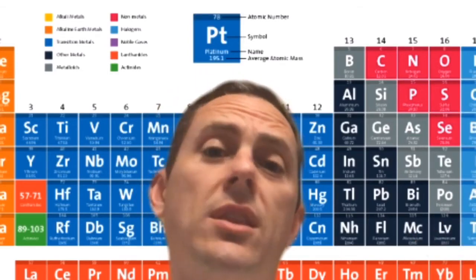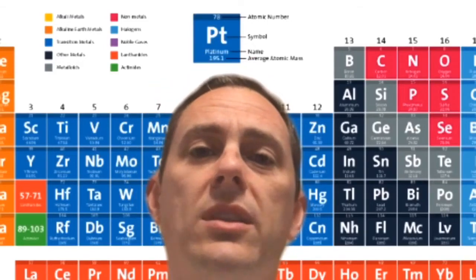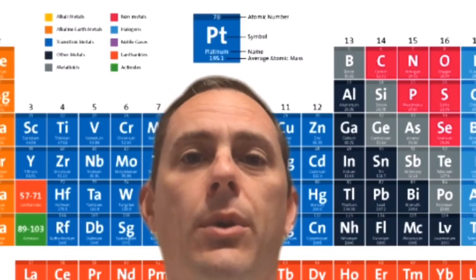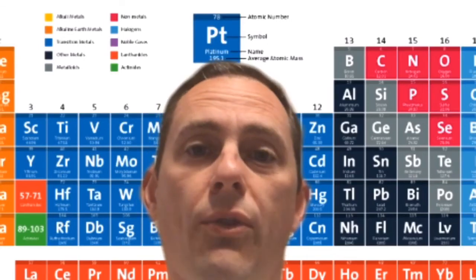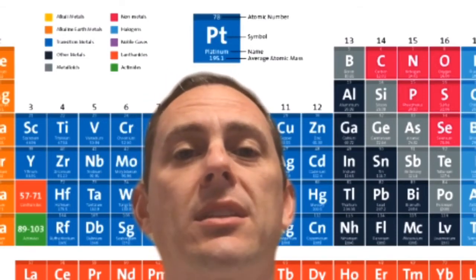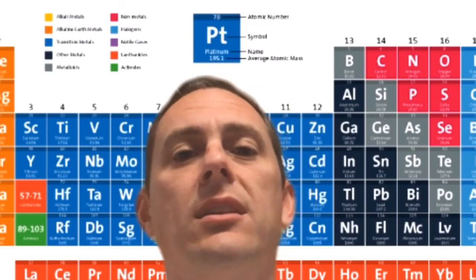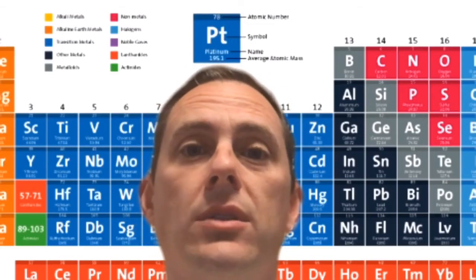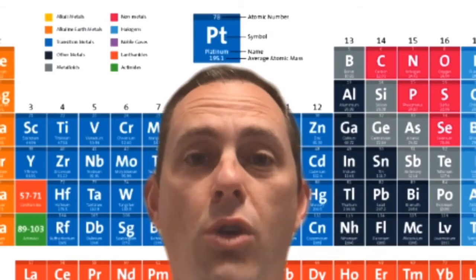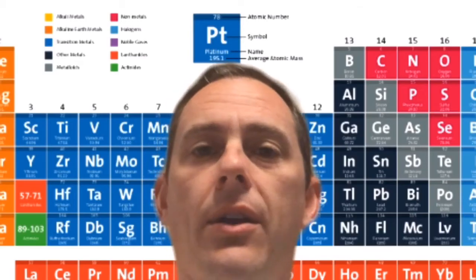We know that's actually because of isotopes and averages, and we were able to find what these isotopes were and their abundances using the mass spectrometer. But it could do so much more for us. The mass spectrometer could be used to help us distinguish between isomers and different organic molecules as well. So let's take a quick look back at the mass spectrometer and be reminded of what was going on there.